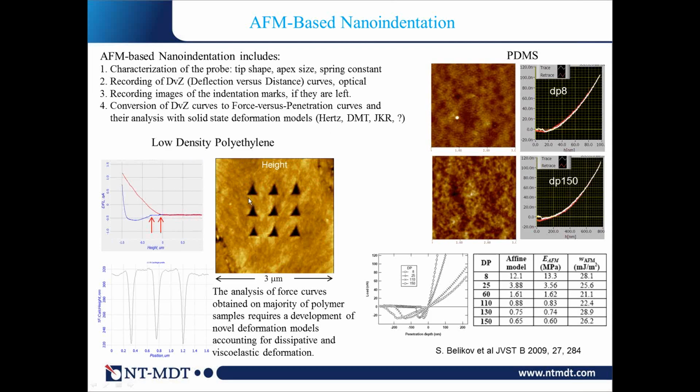You see, we intentionally left the marks, but here there are no pileups. This is one type. In some materials you will see there are bright features around. That means pileups. You push material. There is a lot of plasticity in this case of material, plastic deformation. Here we've just done that.